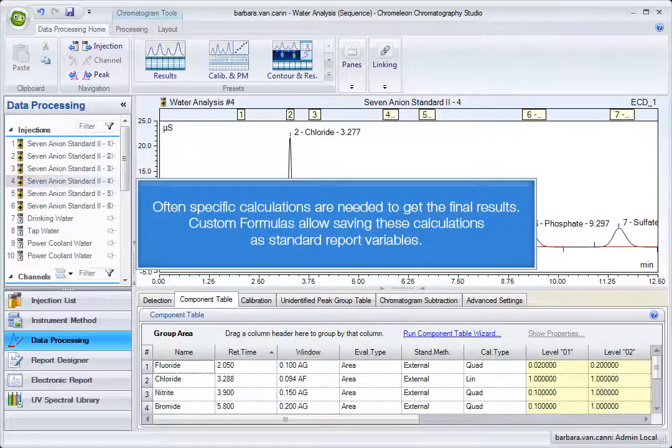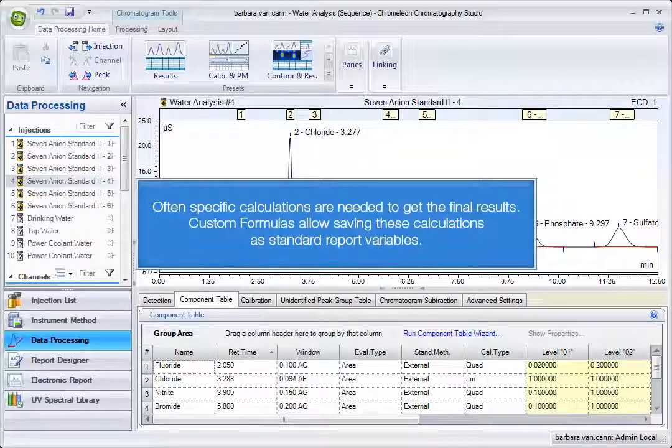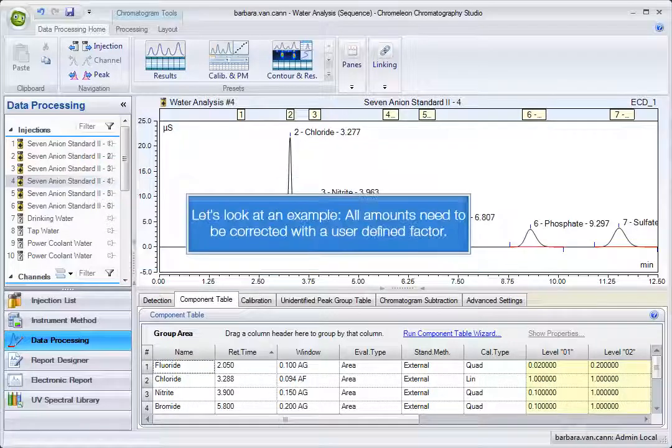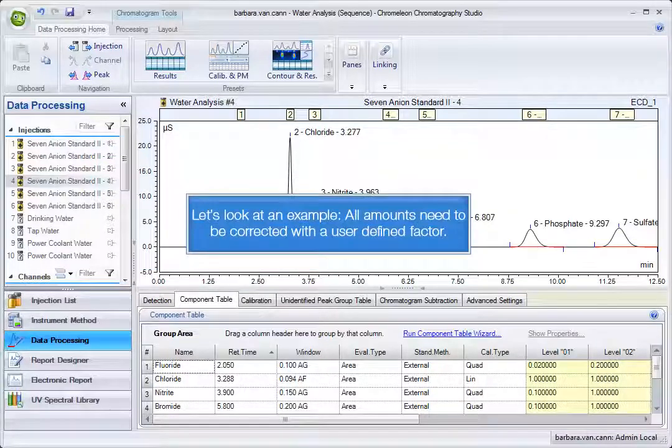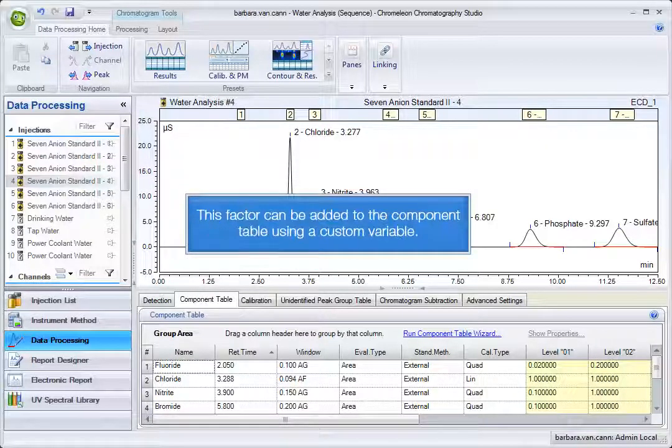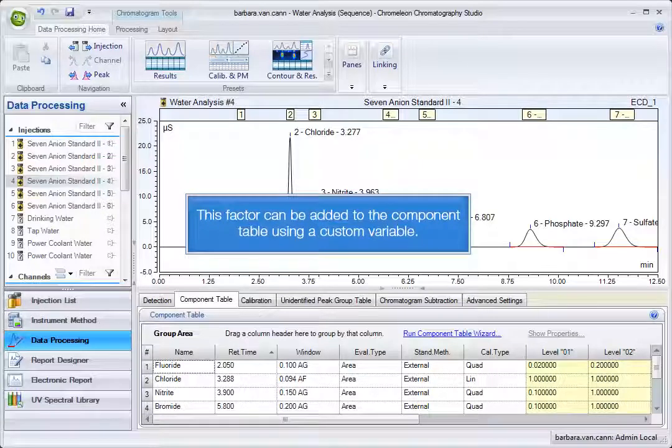Often specific calculations are needed to get the final results. Custom formulas allow saving these calculations as standard report variables. Let's look at an example. All amounts need to be corrected with a user-defined factor. This factor can be added to the component table using a custom variable.